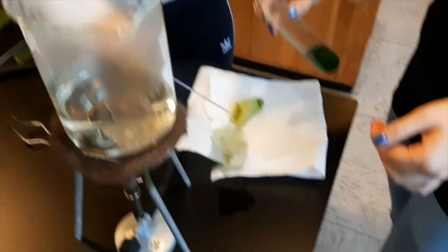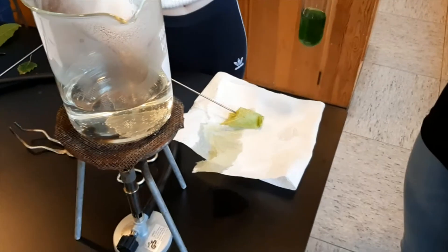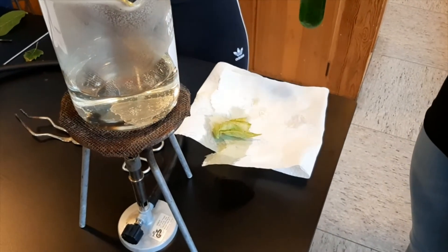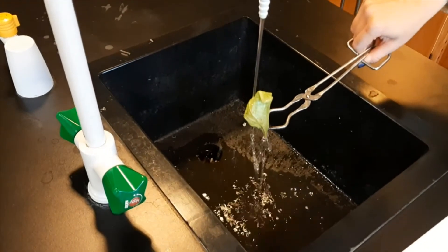What has happened to the color of the leaf now? It's gone. You place the leaf in cold water for a few seconds, then put it back out and spread it out.